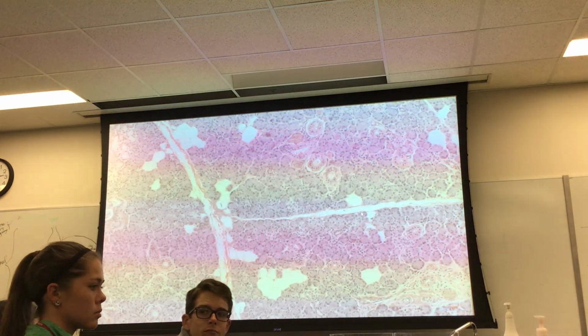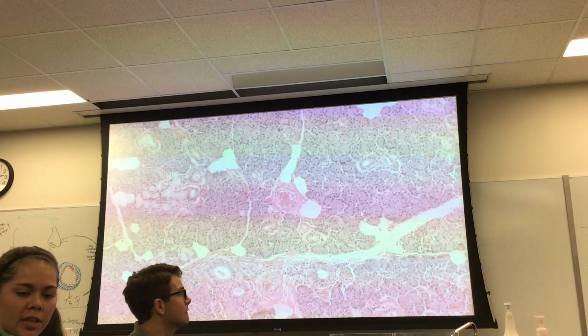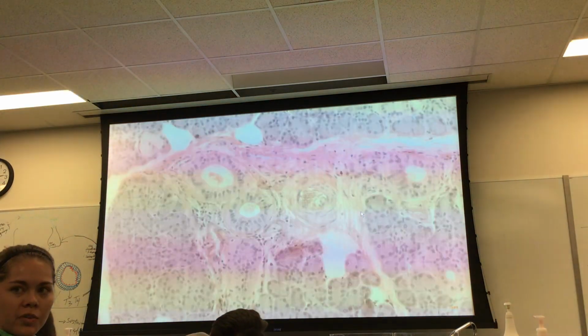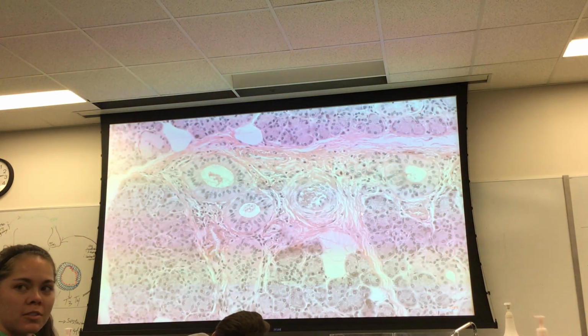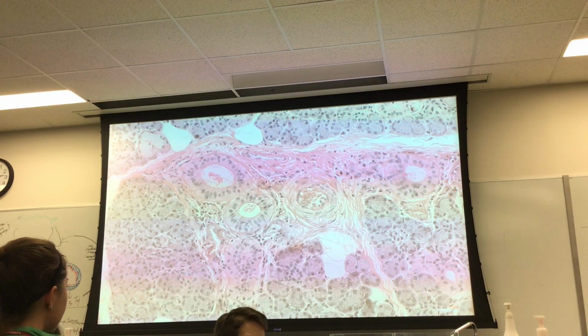Now the other thing we're going to do, this is again about a year from now, is as we look around, we're going to see in these little connective tissue areas that these are big ducts, but also, hey, look, these are blood vessels. So we're going to study all the different types of blood vessels as well. And again, always look at the interior. But the first thing we're going to do in the spring, and now you're already equipped to do this, I'm pretty happy about that. So let me just show you what we're able to do here.